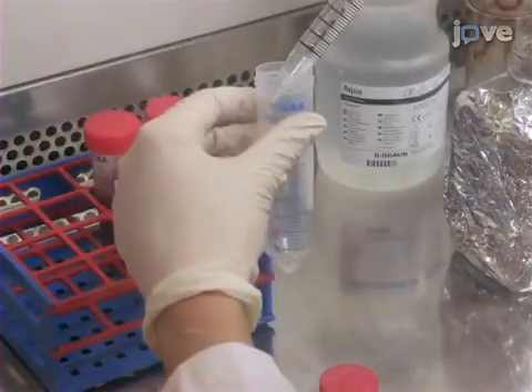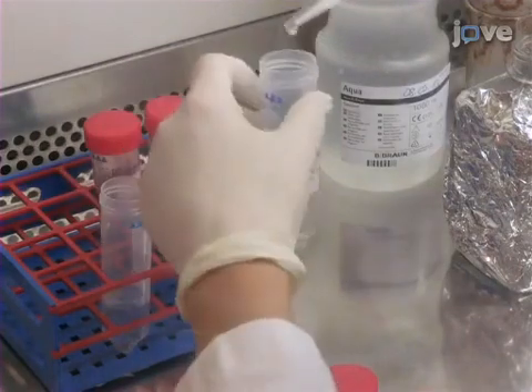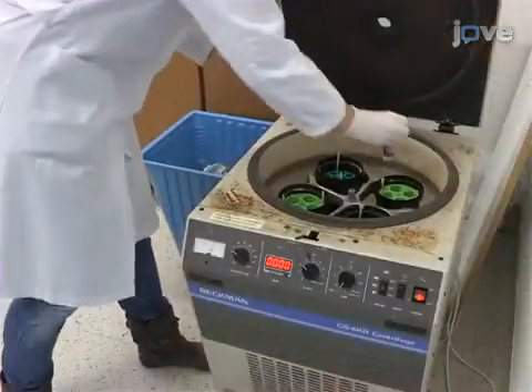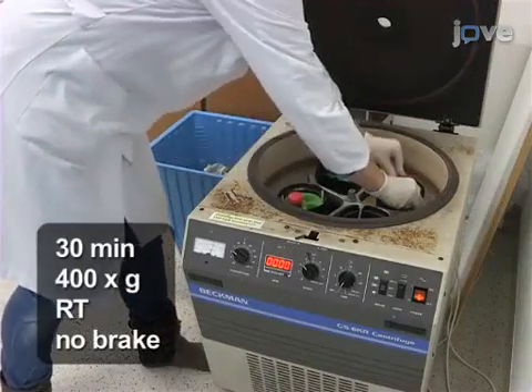Next, add 25 milliliters of histopaque to the 25 milliliters of whole blood and PBS in each tube, taking care that the histopaque and blood do not mix. Then centrifuge the tubes for 30 minutes at 400 Gs and room temperature with no brake.